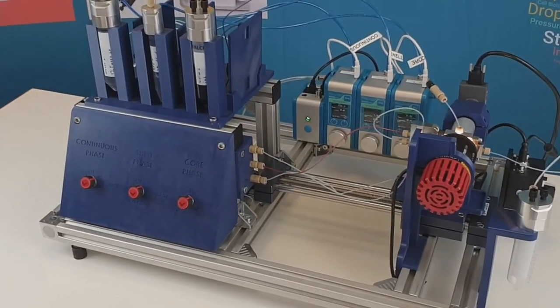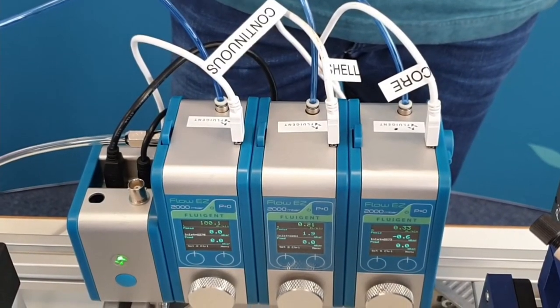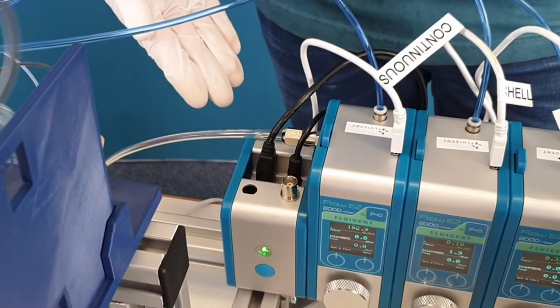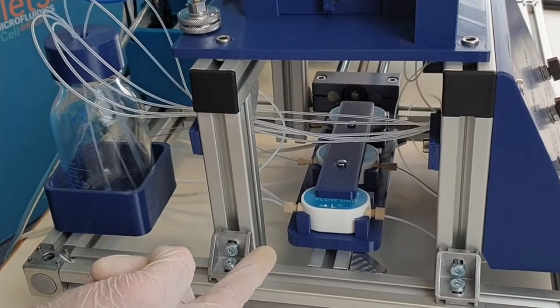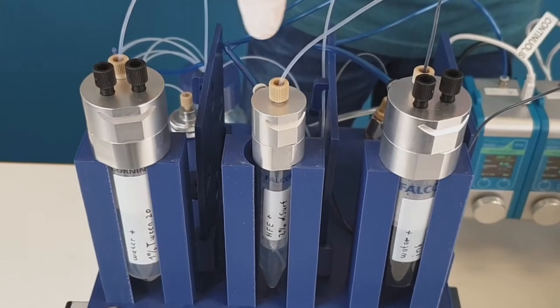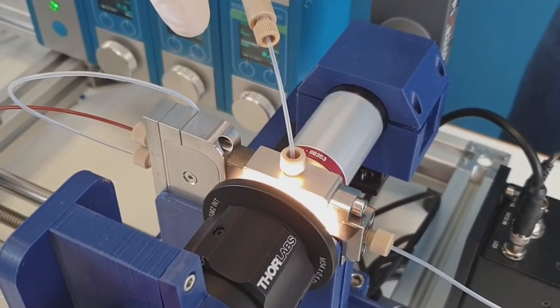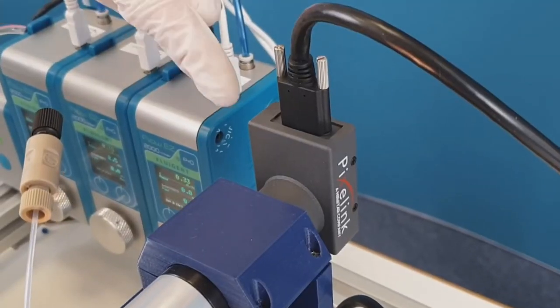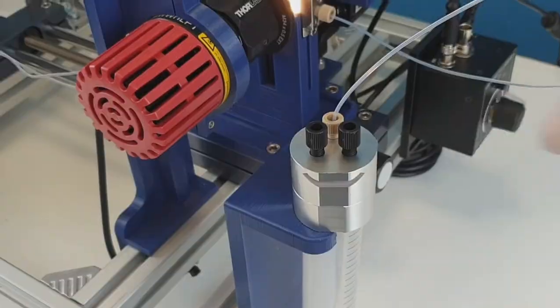Here are the devices we need for the experiment: three flow eases for each phase accordingly, a link module, three flow units, reservoirs with p-caps and tubings, the double emulsion ray drop, optics with camera, a reservoir for droplets, and a laptop.